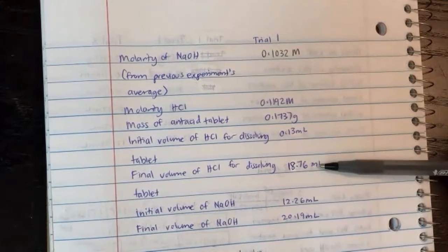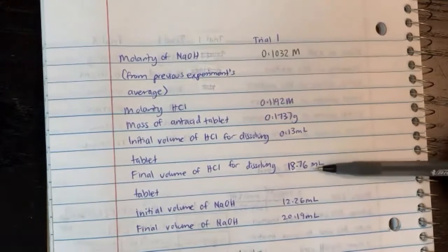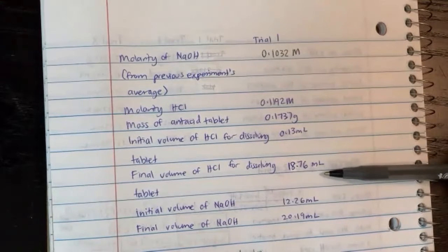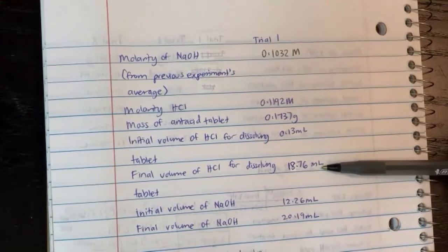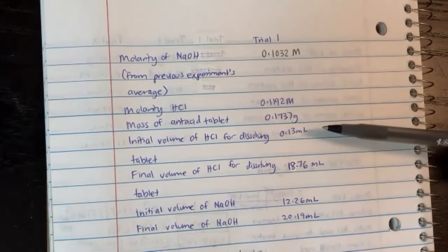So we'll use an excess amount of hydrochloric acid. Some people use between 15 to 20 milliliters. It depends on the experiment. So for the student here, the data set will be 18.76 mL as a final. Initial volume of the burette for the HCl was 0.13 milliliters. And then you'll have a second burette.